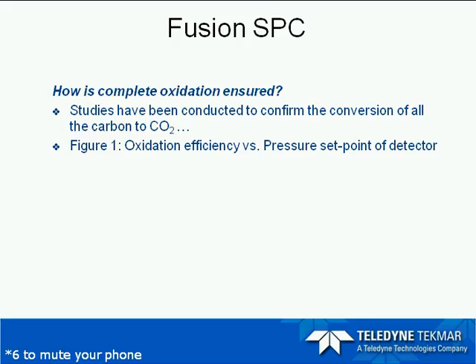Now we have established through these optimization studies appropriate method parameters and minimum concentrations for the torch and the fusion. We've also established default methods within the fusion and the torch. We've established wastewater, drinking water, and pharmaceutical water parameters to help you with method development.